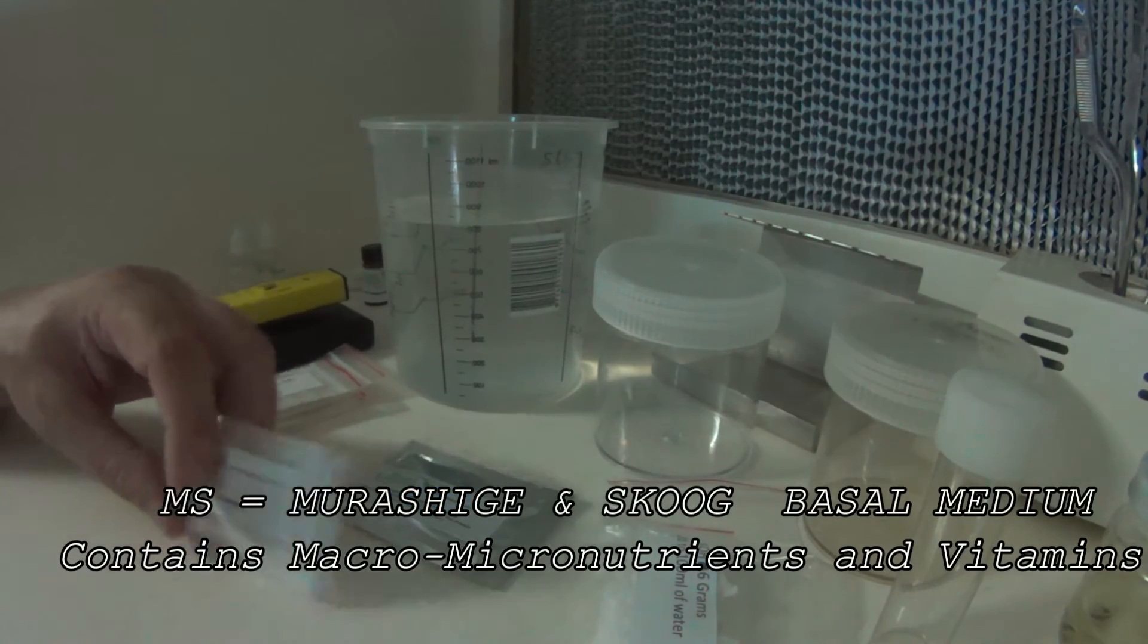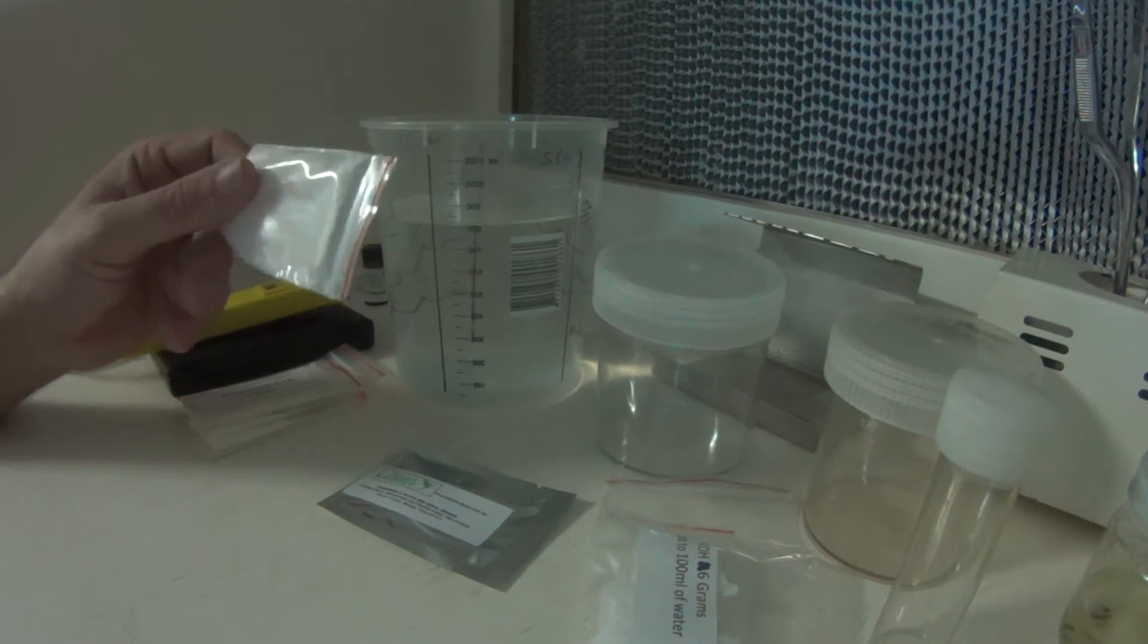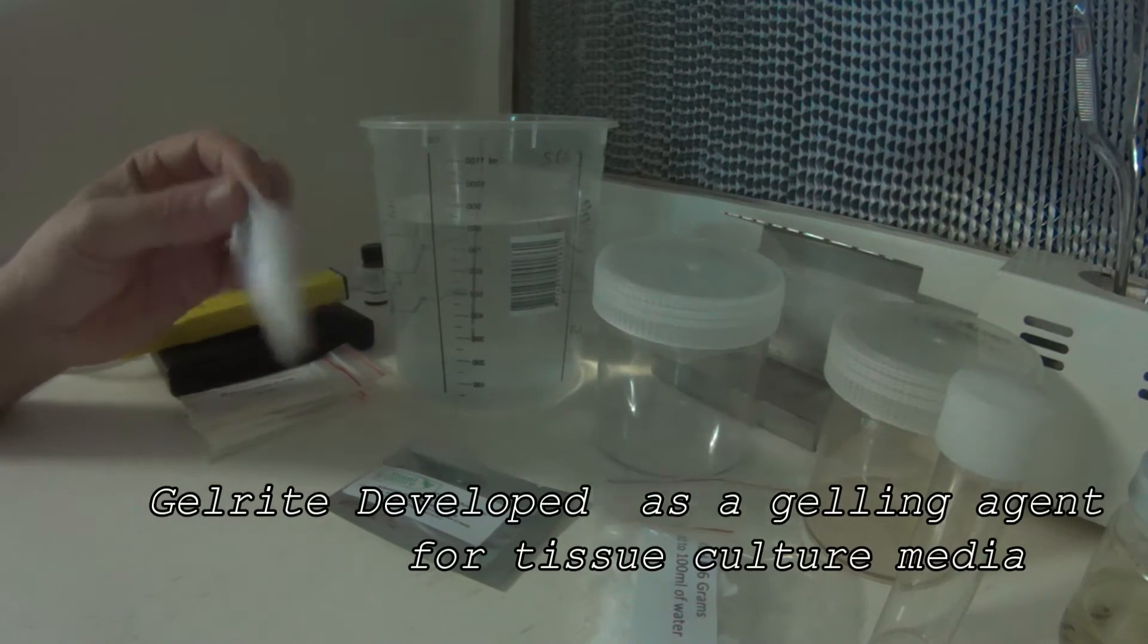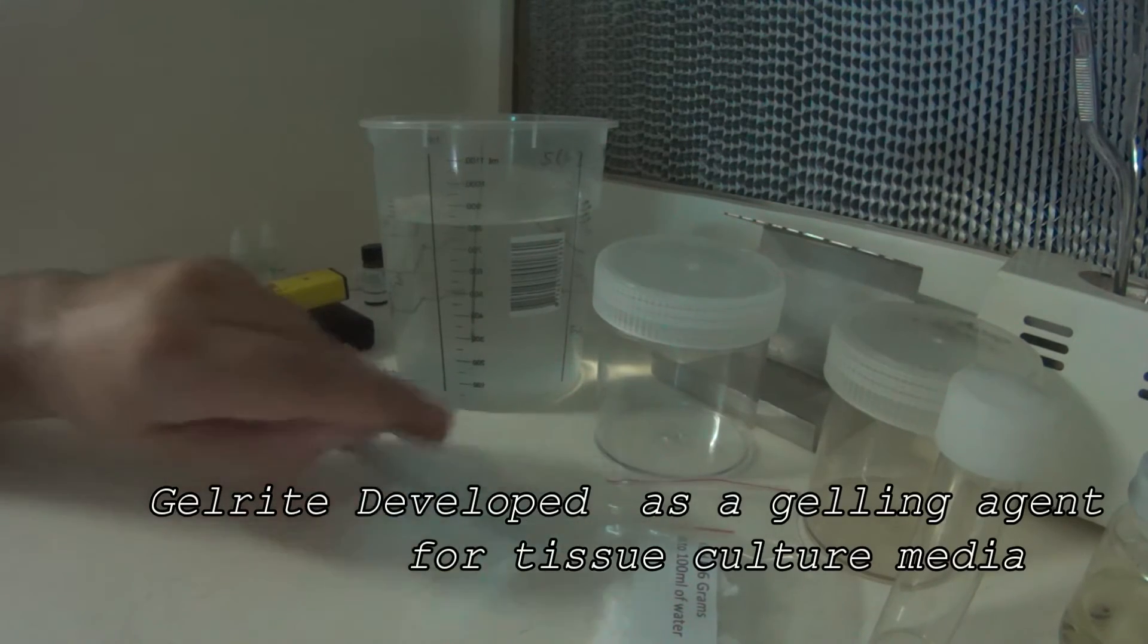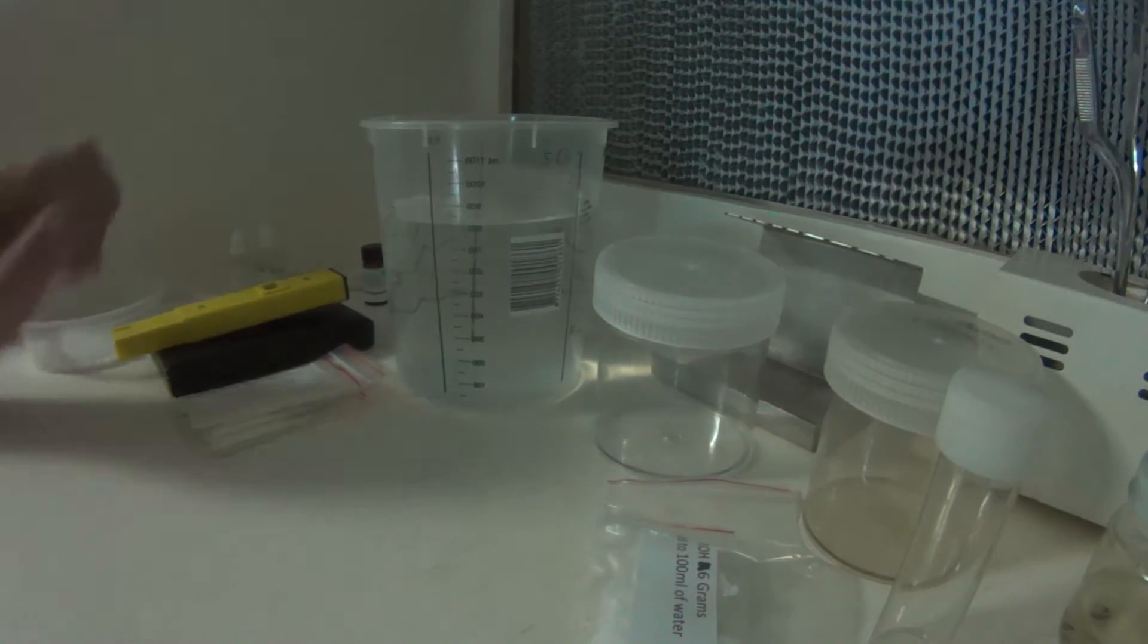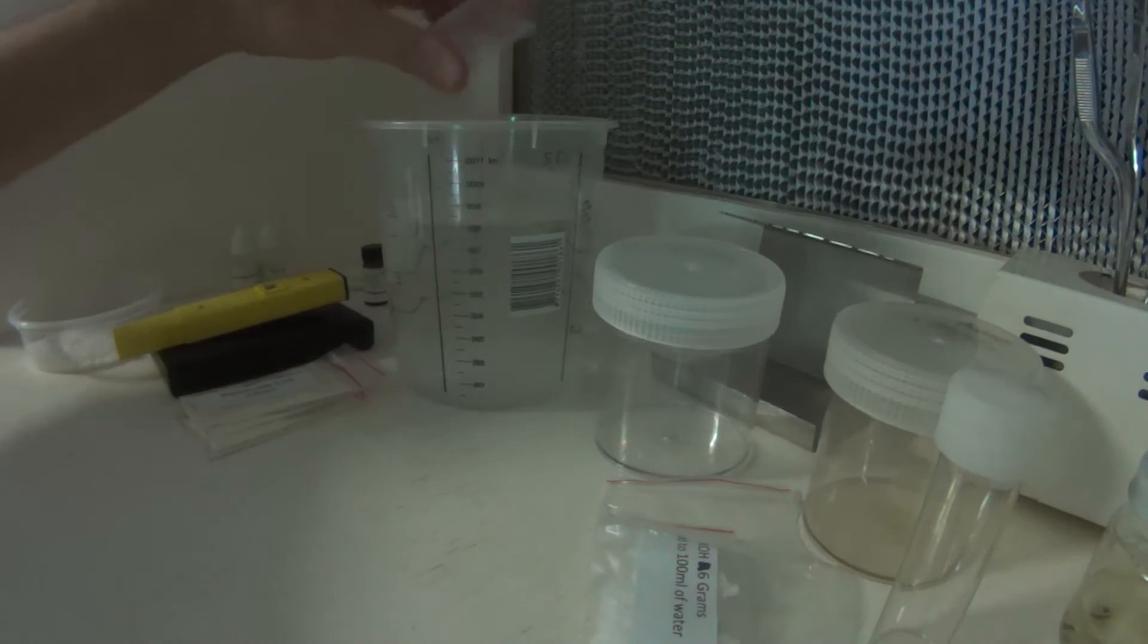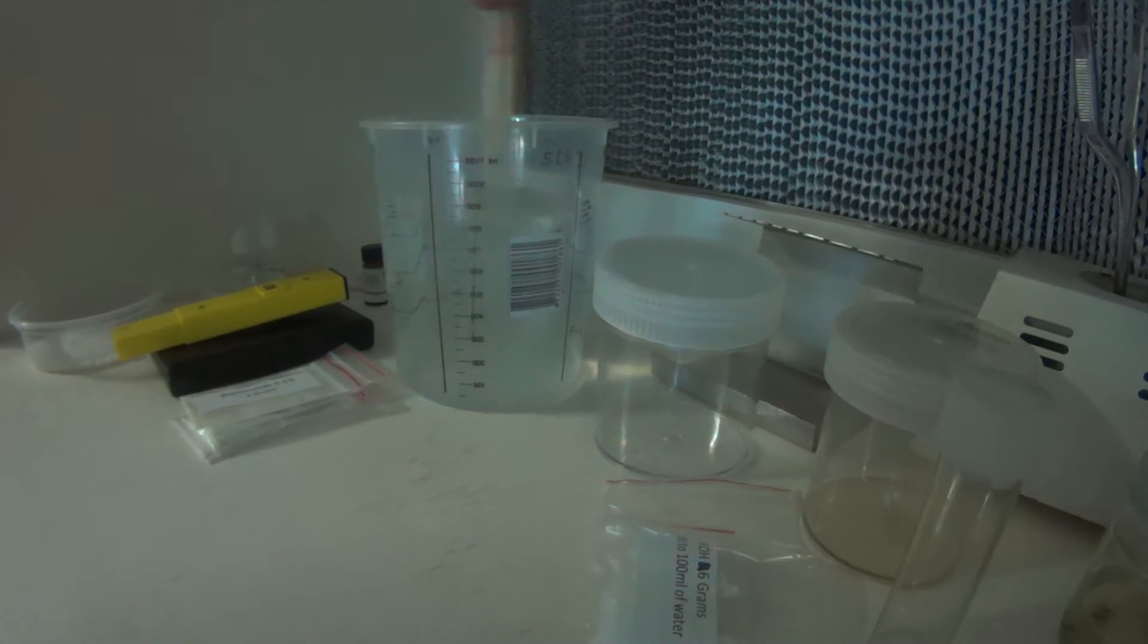Also we supply in the kit 4g of Gelrite, this is enough to solidify one liter of media. So once again, the whole contents in. I've already got them weighed out over here, so get them out of the way, and we'll start. Here's our MS salts. There we go, now just give it a mix up.